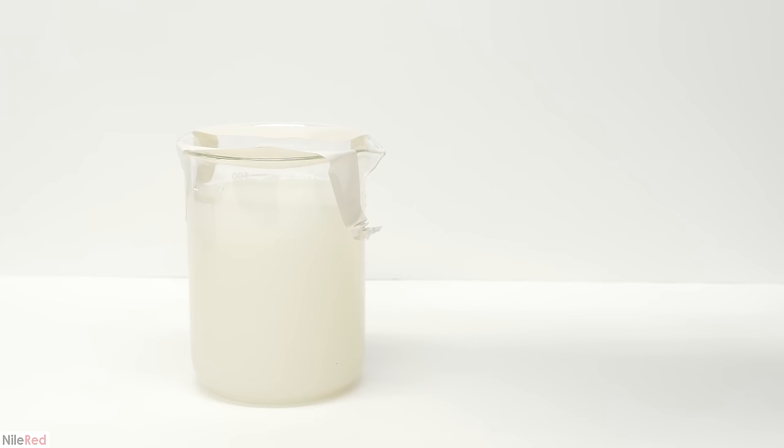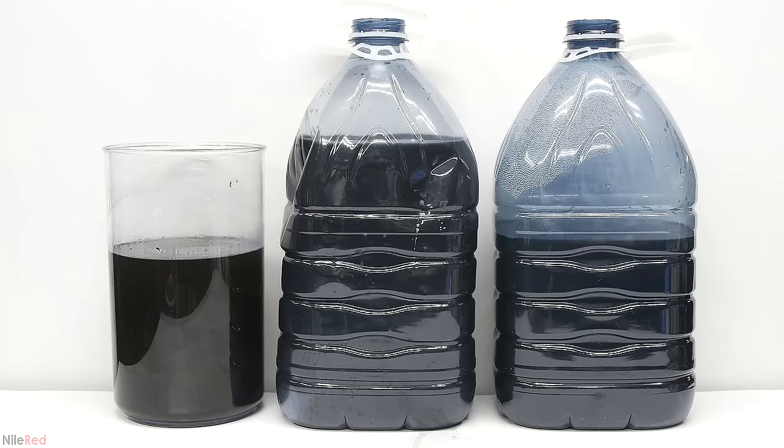Now we're done with the easy waste and we can move on to the more annoying stuff. In these three containers is all of the water waste from when I was liberating the mercury. The one on the left was the first washing, so it's very concentrated in sodium sulfide and sodium hydroxide. The two bottles also contain some, but the concentration is much less.